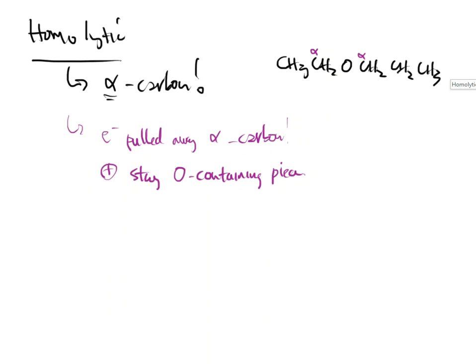There's no difference. All right, so I'm going to actually draw an ether. We're going to kind of get to the bottom of this for a minute. And this ether I'm going to draw is going to look pretty complicated, but I'm doing it on purpose because I want you to understand it's not really the entire molecule as a whole. This is really just one area of the molecule that you have to place a focus on. So here's an ether. The left hand and the right hand sides are different, so it's not a symmetrical ether.